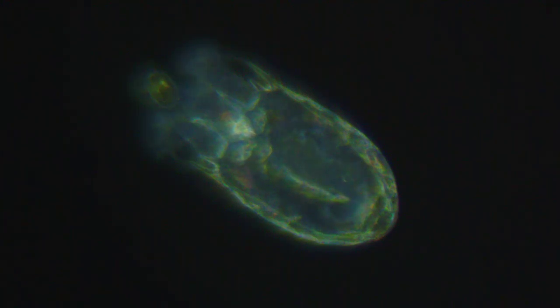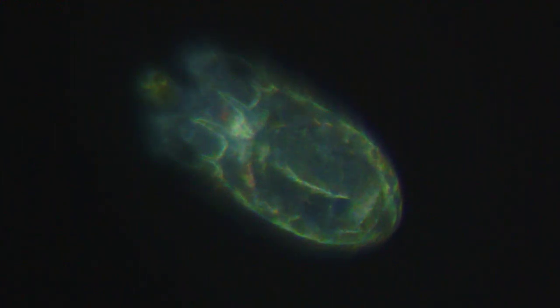So here we have a rotifer. See his little wheels spinning? Two little wheels moving the water around.